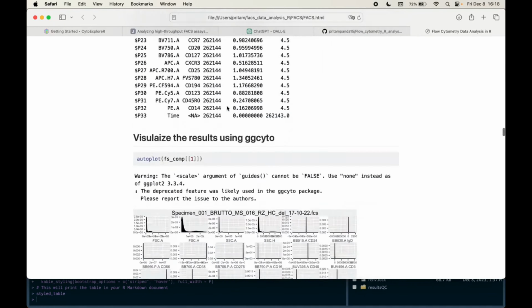In the previous video, we have seen how to analyze the flow cytometry data using R. Today we are going to explore the CytoExploreR package, which was previously known as CytoSuiteR. So this has been changed by the author to this particular name, and this is the complete workflow of how you can do gating, manual gating, and also you can explore the automatic gating as well. But this package has some more features that you might expect from a commercial software. Those who do not have access to commercial software can explore CytoExploreR and utilize the functions that have been implemented by this particular package.